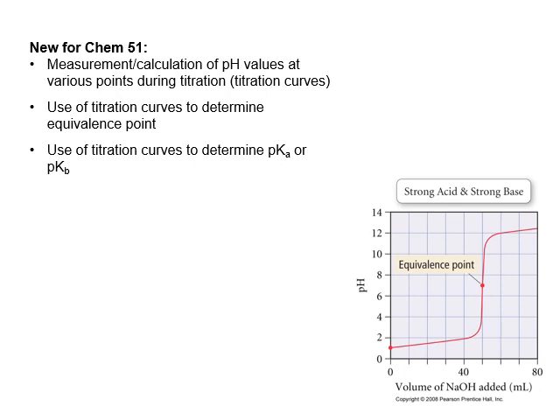An example of something called a pH titration curve is shown to the right. The pH is usually plotted on the y-axis, and the volume of the added titrant is plotted on the x-axis. Titration curves typically have a special S shape, and we'll see more about this in later slides.